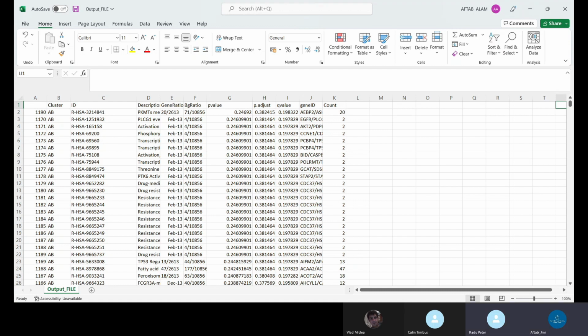Okay. So you can use your own p values because when there is too much data, like 5,000 or 6,000 proteins, you can just reduce the set size, reduce the p value, so you can get the maximum significant values. Here I have about 400 proteins. I have just selected 1, so we can get the maximum.